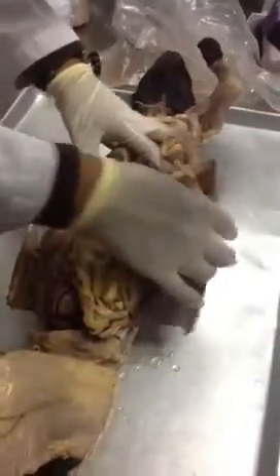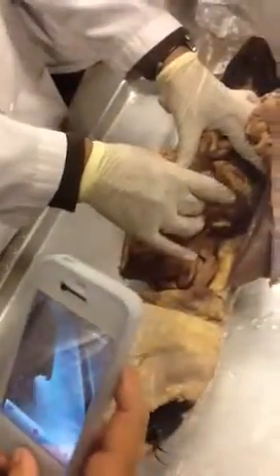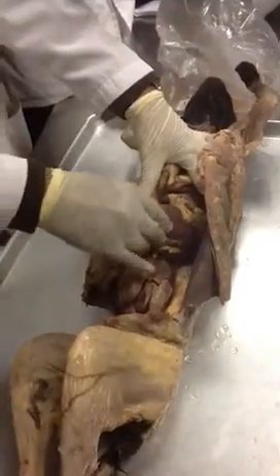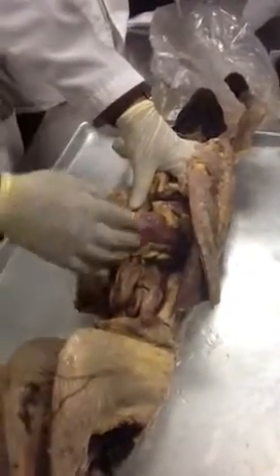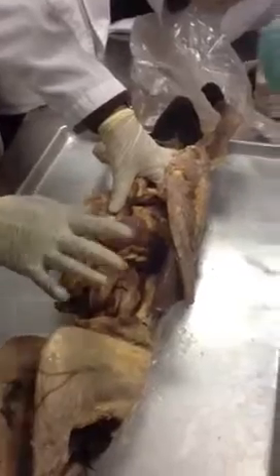Now about the other structures. Here is a very big structure on the upper left side. That's what you call the spleen. The spleen is not part of our digestive system, even though it is very closely related, but it is part of the lymphatic system. It cleanses our blood and helps our immune system develop. Earlier in life, the liver and spleen used to produce blood cells, but no longer do.